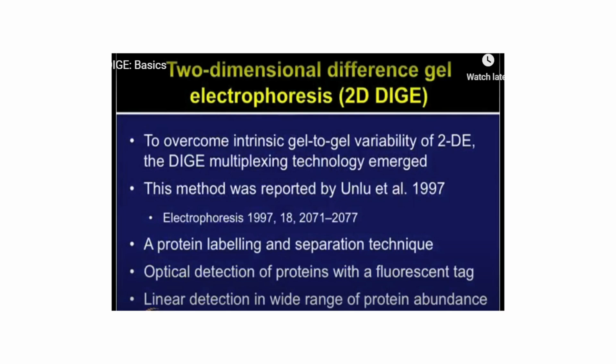That's what we learned, but there is some gel-to-gel variability generally seen in 2D gel electrophoresis, and the DIGE technique will overcome that specific limitation.